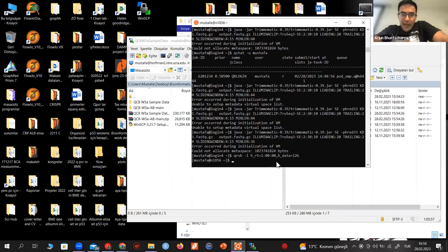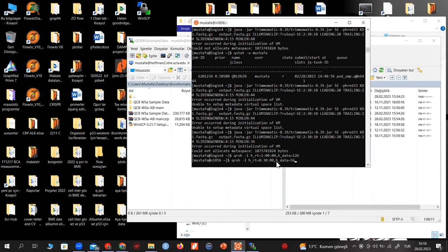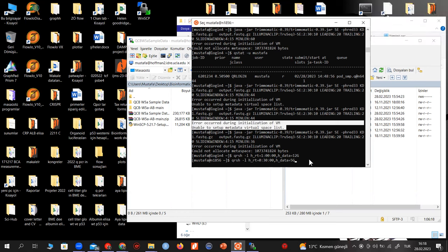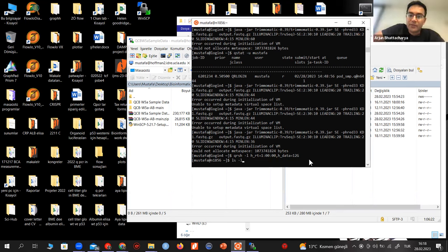Okay. So now see the difference? You had login 4. You had Mustafa at login 4. Now you have Mustafa at n1856. Okay, but actually I was asking for this code here. Yeah, so now you have to load up Java again. The reason you weren't able to run it back then is because you were on the login node.